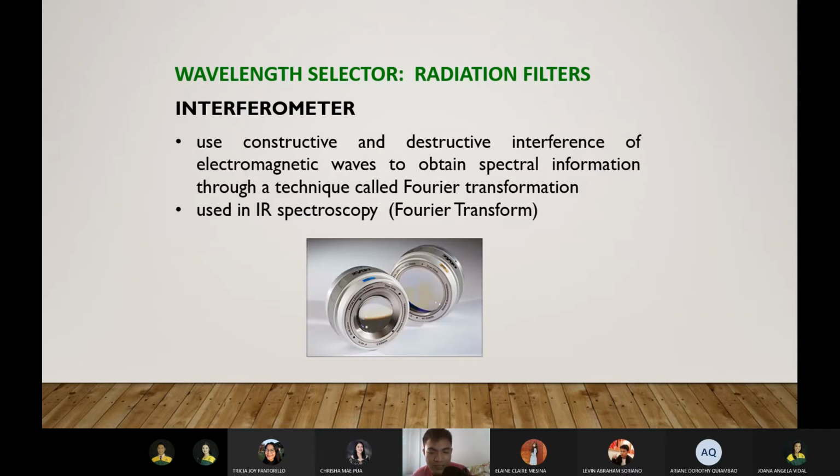Say you are doing IR analysis instead. In IR analysis, a possible source of interference could be the analyst themselves. The analyst can be a source of error. Why? Because remember, I said in my lecture that we ourselves glow. We are literally glowing because according to physics, if an object is warm, it has a wavelength. And apparently we are warm, 37 degrees Celsius at normal temperature, right? So we are also emitting wavelengths in the form of IR, infrared rays.